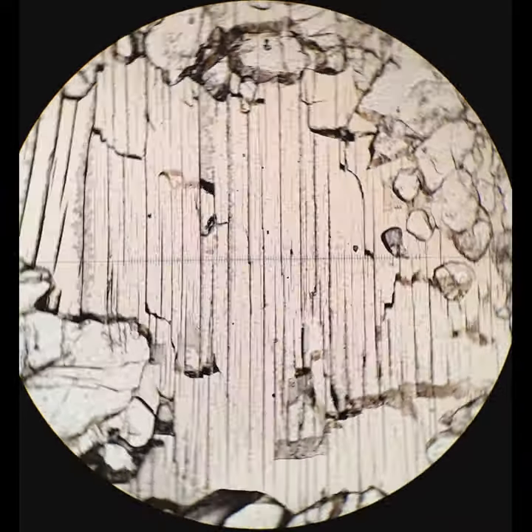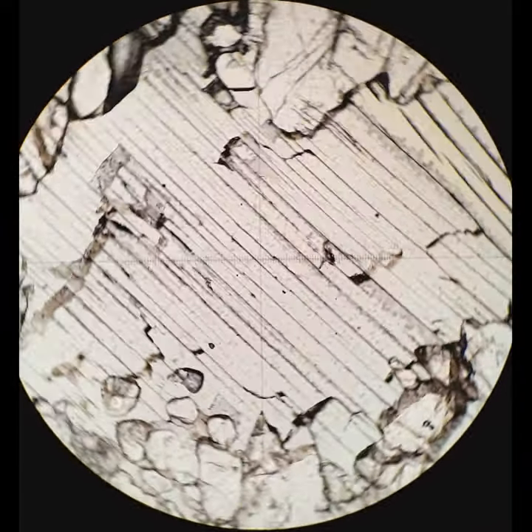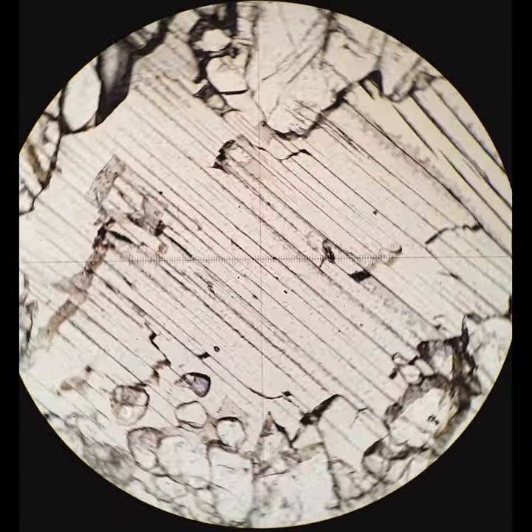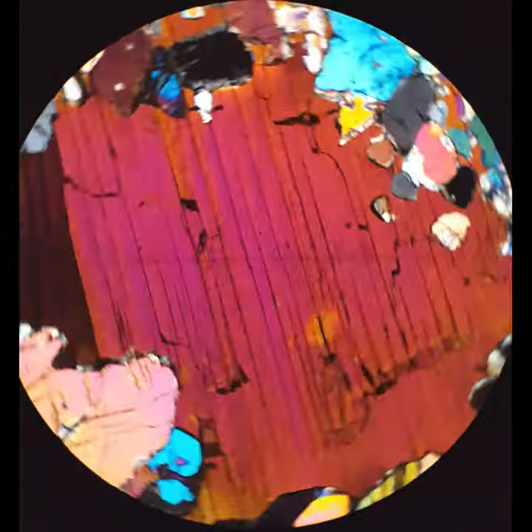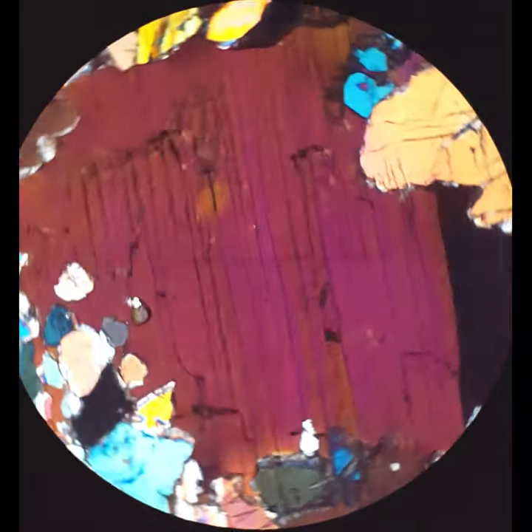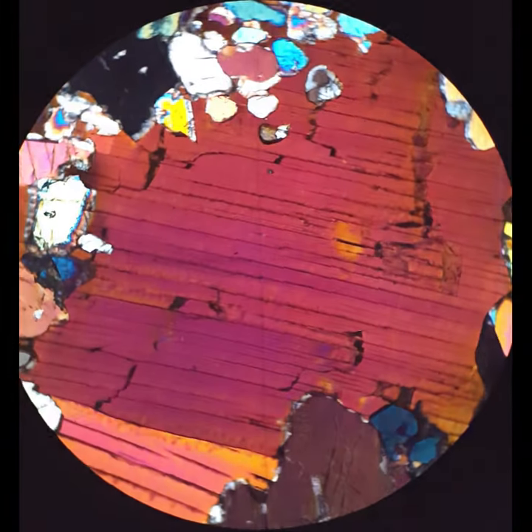Cleavages are planes of weakness along which a mineral will split preferentially. Some minerals, like micas, have only one plane of weakness, or one cleavage — that's what those thin parallel lines are. Other minerals, like amphiboles and pyroxenes, have two. The angles that cleavages make and the orientation of the cleavage when the mineral is extinct in cross-polars can be used to identify minerals.